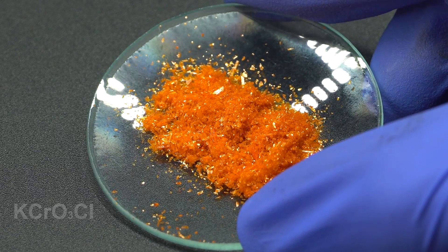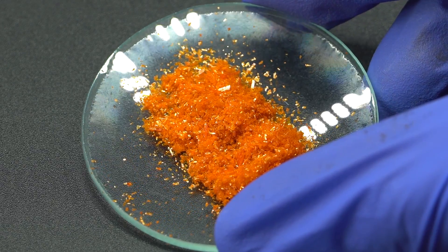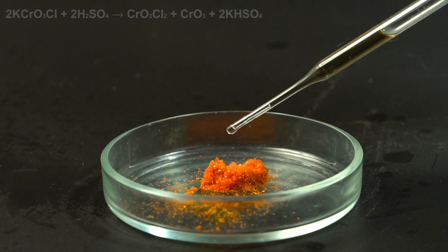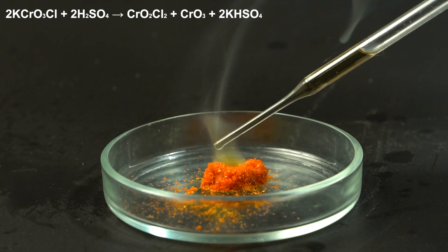These orange crystals resemble potassium dichromate, but unlike the latter, they interact with concentrated sulfuric acid in a way that they form not only chromium trioxide, but also chromyl chloride, that can set liquid ammonia on fire.